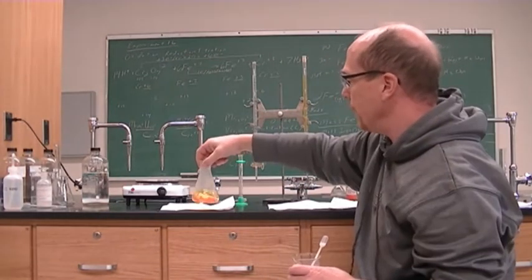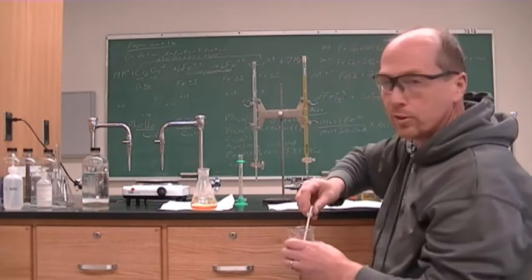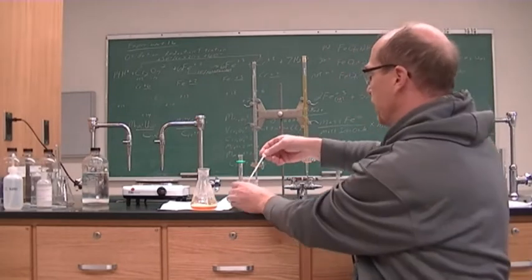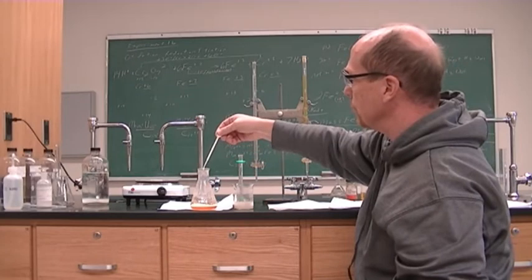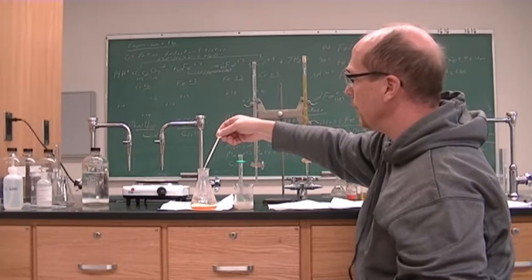We're going to have to add tin chloride until this solution becomes colorless, and we don't want to add too much extra tin chloride.